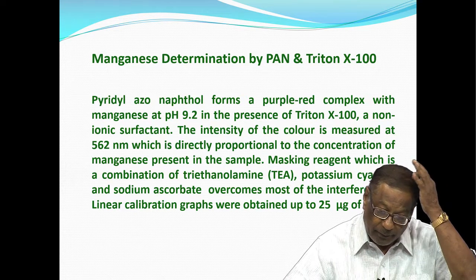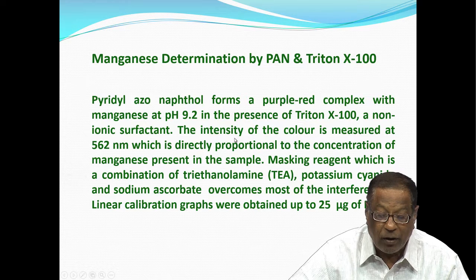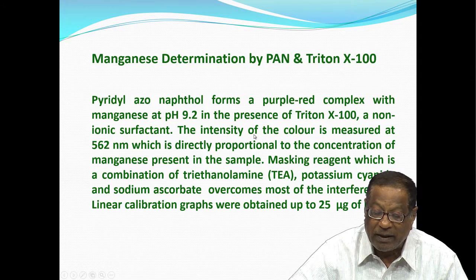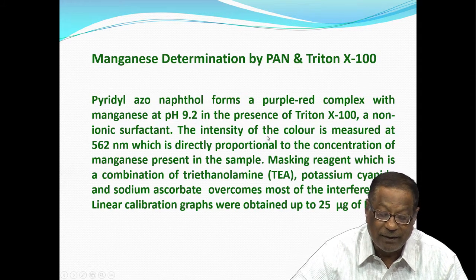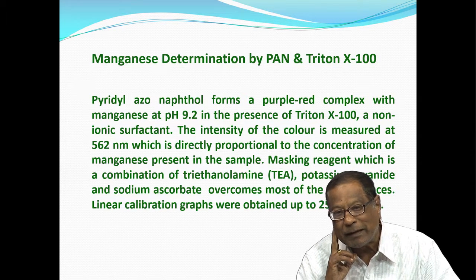So, this pyridyl azonaphthol forms a purple red complex with manganese. The reaction occurs in alkaline pH. That is one advantage.